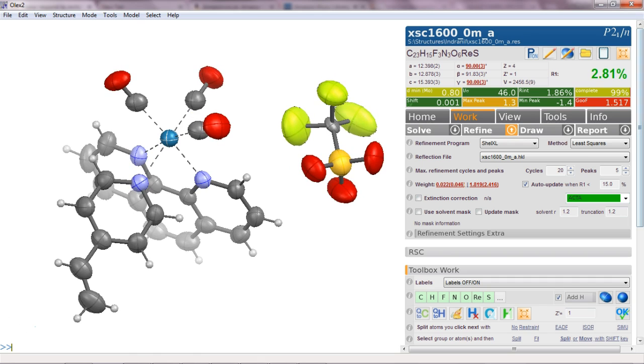You're looking at an R-factor at just under three percent. We've got a very strange 90.00 angle with an ESD of three but the thing is monoclinic, so that really should be 90.00 with no ESD on that, but that's neither here nor there. The goodness of fit didn't really work out very well.